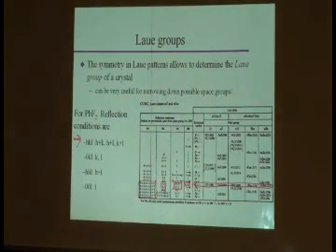If you look at that one, there are 5 entries in that line. 5 possible space groups. They cannot be distinguished based on systematic absences. Now, nowadays you have computers. Big deal, right? However, in the old days, when you did everything by hand, would you have liked to attempt a crystal structure solution in 5 different space groups? Probably not, right? If you can do anything to help yourself out, you'll do it.